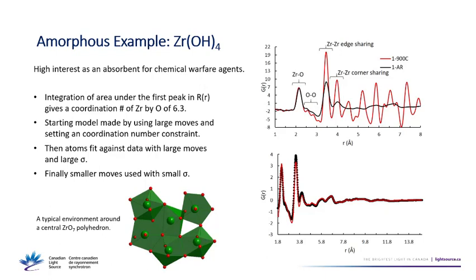It's not so important for modeling because you just refine a temperature parameter and it will fix it. But it can be useful to measure things. Sometimes people do measure PDFs at low temperature just to make the peaks sharper. Like if you had 2 different types of atom pairs that are very similar, like iron-oxygen and ruthenium-oxygen, which probably differ by 1 or 2 tenths of an angstrom, and you wanted to tell them apart, then you can try to get really high Q data to reduce the instrumental peak broadening, but you can also cool down to low temperature to reduce the thermal peak broadening.